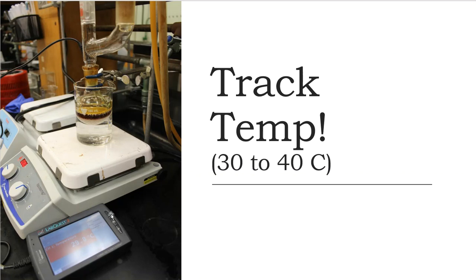All right, here's a zoomed out picture of what was going on. Here was my Vernier LabQuest thermometer probe and my LabQuest 2 device. So here is where I was keeping track of my temperature. And of course, this black cord, if you see it from up here at the top going down into my beaker, is giving me the temperature of the water bath that my boiling flask is in.